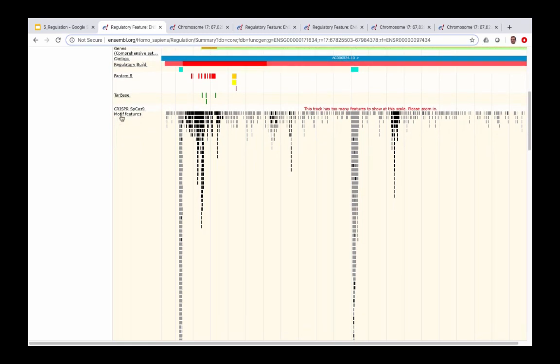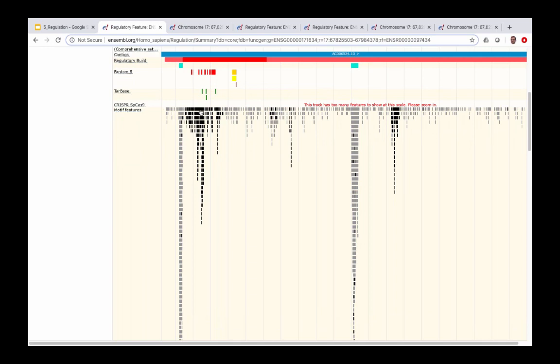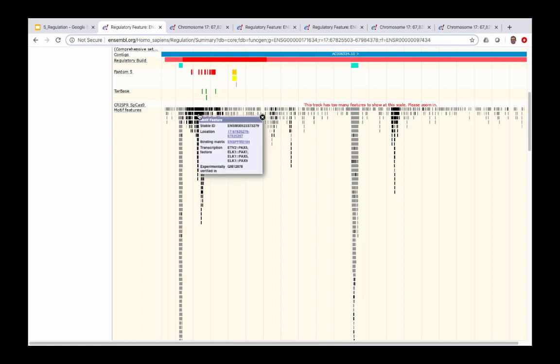The black and grey blocks in the motif feature section represent different transcription factor binding motifs that are either predicted or experimentally verified in this region. Black features represent experimentally validated transcription factor motifs. Clicking on one of these features opens a pop-up window showing a stable ID for the motif feature and the transcription factors that bind to this motif — in this case experimentally validated in GM12878 cells.